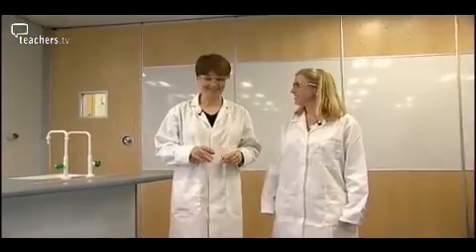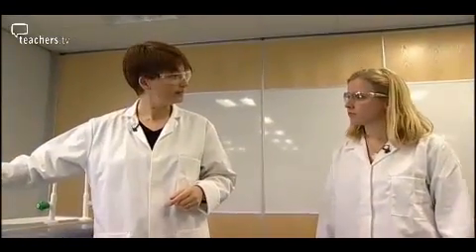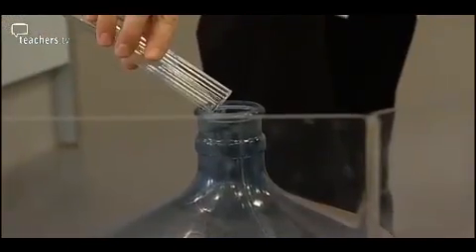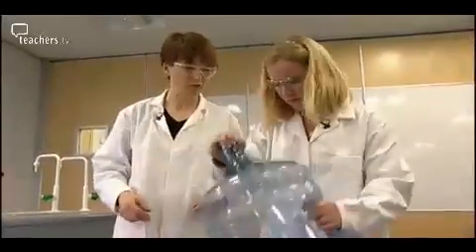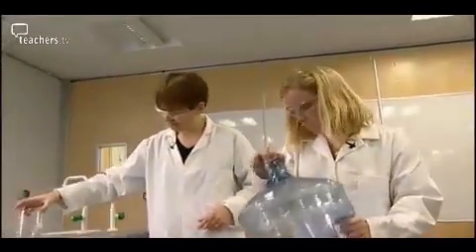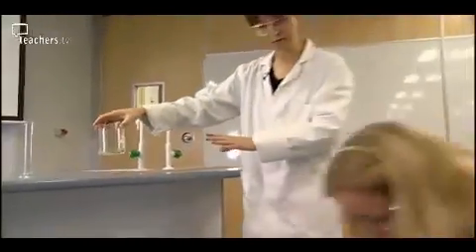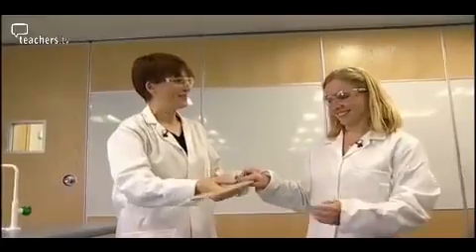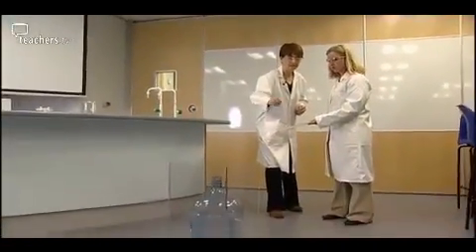Combustion of alcohols on a slightly larger scale. We've got a polycarbonate plastic bottle and some propan-2-ol. The first job is to put the propan-2-ol into the bottle, then pick the bottle up and give it a really good swish round. It's important to really give the bottle a good rolling to produce as much vapour as possible. Pour out the excess into a beaker, or you may end up with a fire that melts the bottle. Put the bottle back on the mat behind the safety screen, keeping the propan-2-ol well out of the way. We've got propan-2-ol vapour in there, and you're going to ignite the vapour — just get the flame just inside the top, then take a step back.